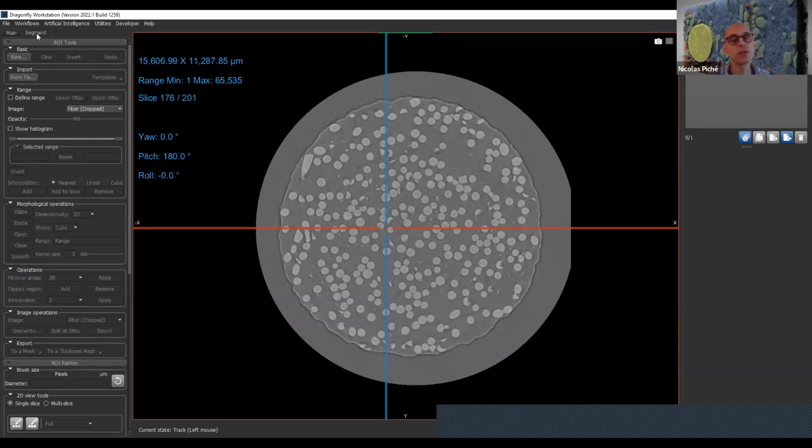Our region of interest representation in code is a red-black tree, so it's interval-based. It's not a dense matrix. So an empty region of interest weighs approximately 0, and a full one, with all the voxels tagged, also weighs approximately 0. In fact, it's two indexes. The more complex the data, the segmentation, the more it weighs.